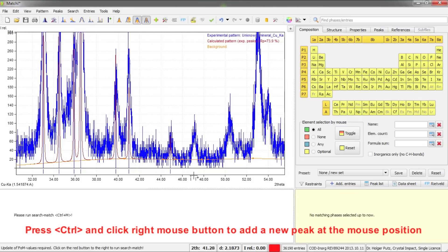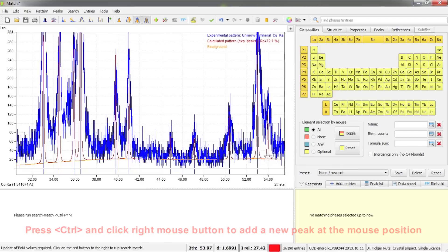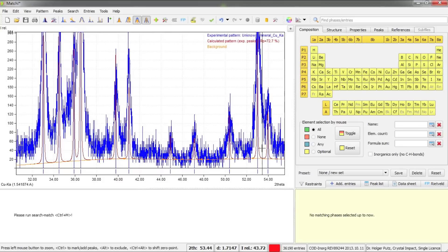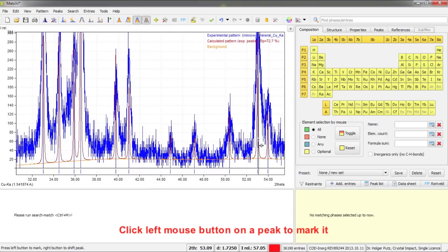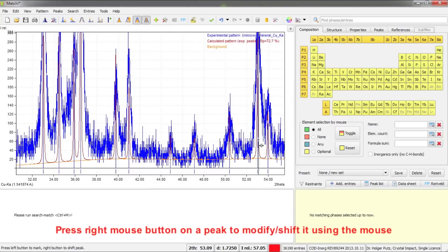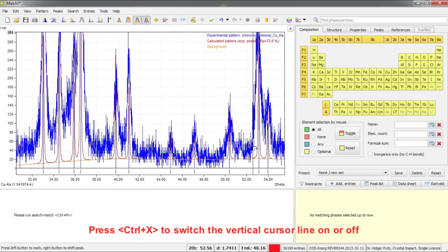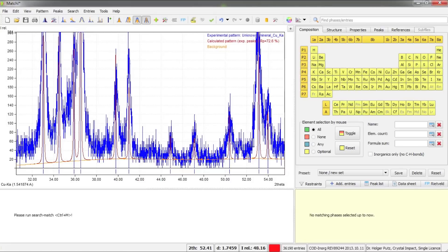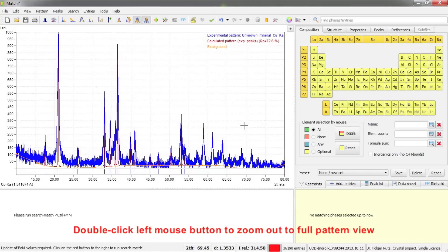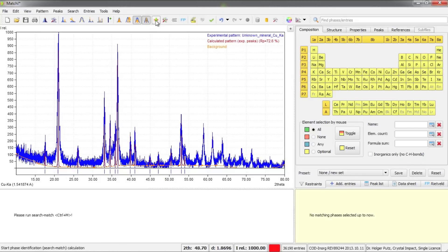You can also modify existing peaks. Moving the mouse over a peak changes the cursor. Pressing the right mouse button lets you shift the peak's position by dragging. I'll move one peak slightly to the right and release. Once done, I'll switch off the vertical position cursor and return to the full view of the diffraction pattern by double-clicking the left mouse button.